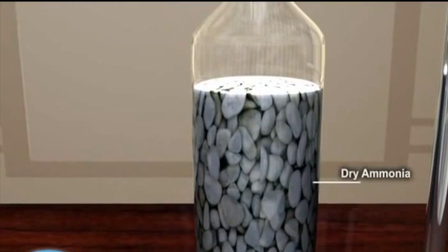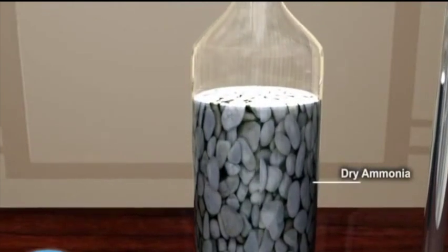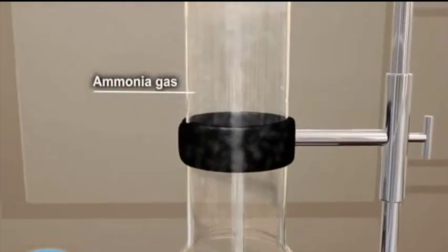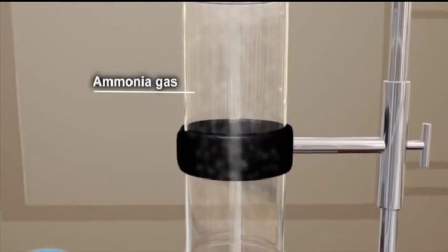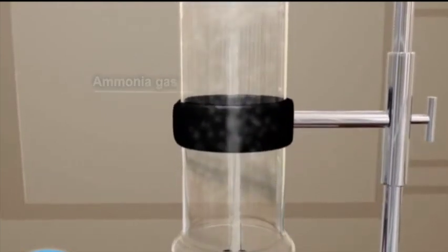Notice that the ammonia is collected with the gas jar upside down. This is because ammonia is less dense than air. It is the only common alkaline gas known. It changes the damp or wet litmus paper to blue.